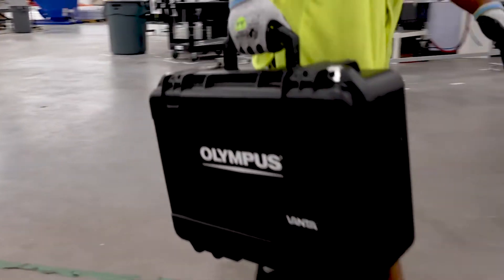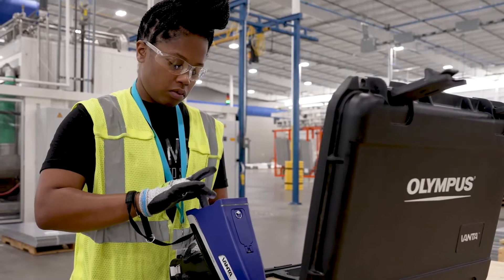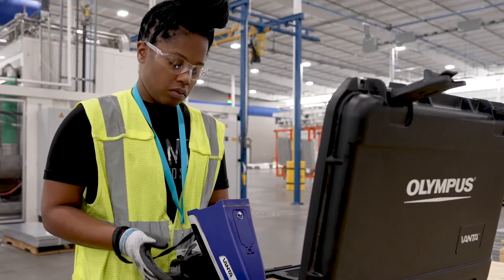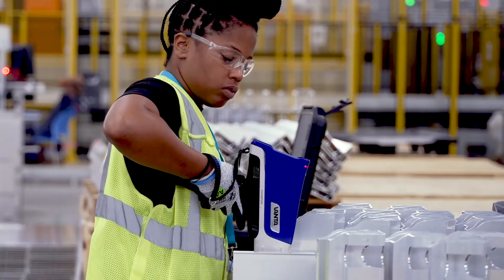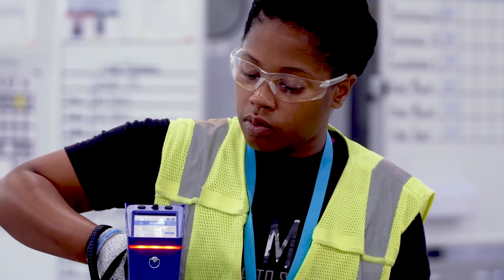My name is Jade Mitchell and I'm an operator at Dura Automotive. Usually I have to assemble the gun, then go in and program it to get it on the screen that I need to be on. I put the XRF gun on the part, pull the trigger, the light comes on, and it begins testing the parts.